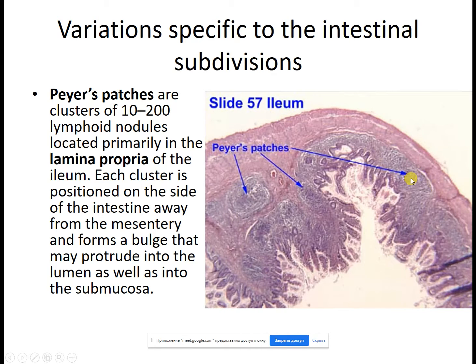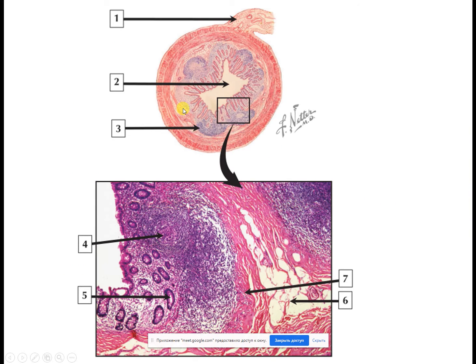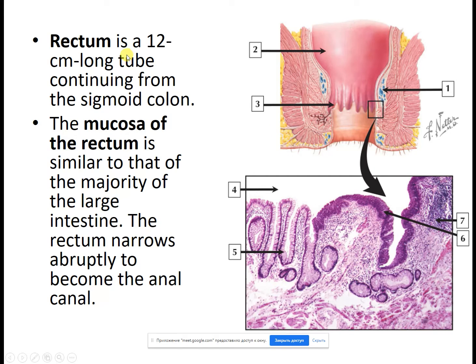They are straight. You see, we don't see the difference between cortex and medulla in Peyer's patches in the small intestine. Here we almost always see differentiation, with a mantle zone and a cortex zone, and a zone inside. This is typical for the appendix. Okay, this is the normal histological structure. In case of inflammation, we will see a slightly different picture. We'll discuss it.